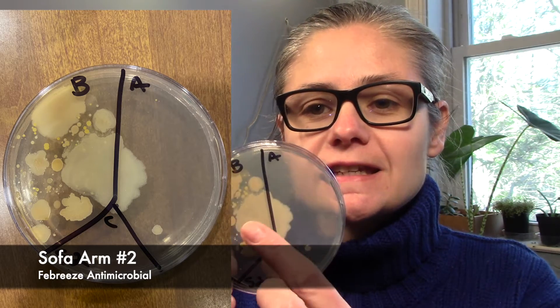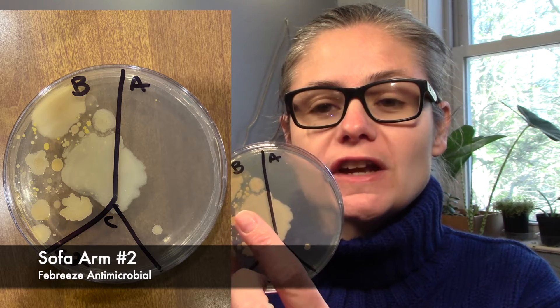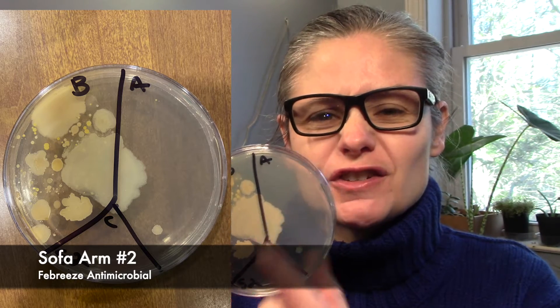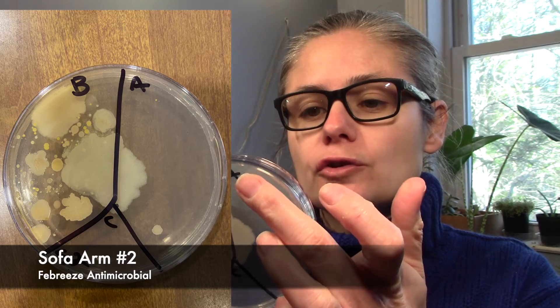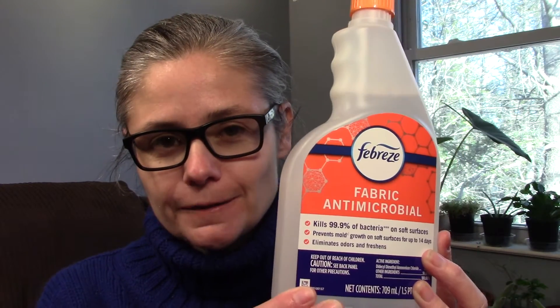With the second sample, the before section is loaded with bacteria. I've been watching this one grow — it did originate in the before section and migrated over into my after section. But ignoring that splotch, there are two tiny bacterial colonies in the after section of the second swabbing of my seat. These results are fantastic. I absolutely love it when I test a product that claims it can kill 99.9% of bacteria, and it does — because on this channel I test products to see if their claims match my real world results, and this one absolutely does.